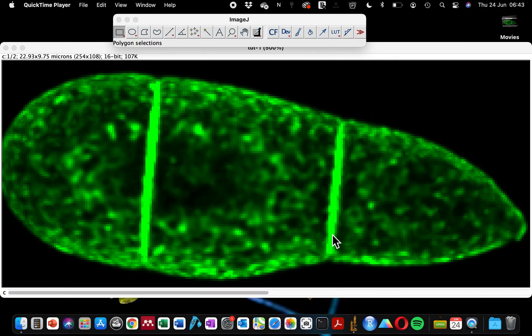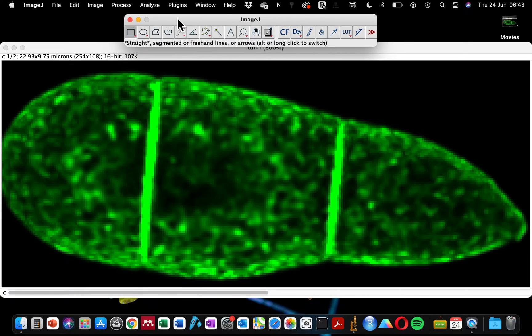For today's tutorial I'm going to show you how to measure the fluorescence intensity within a region of interest in the first part, and in the second part I will show you how to measure several regions of your image at the same time.